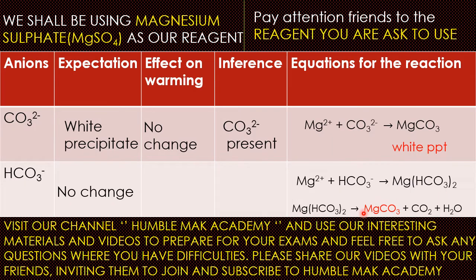So guys, do you recognize this magnesium carbonate? Of course you do, right? Because this magnesium carbonate is the same thing that we have here. And what color was it, guys? A white precipitate. So what should we observe? What do we expect to see after heating? What's the effect on heating, guys? Good. It's going to give us a white precipitate after we must have heated. The white precipitate is due to the decomposition of the magnesium hydrogen carbonate to give us our magnesium carbonate. So after heating, what we expect to see is a white precipitate.